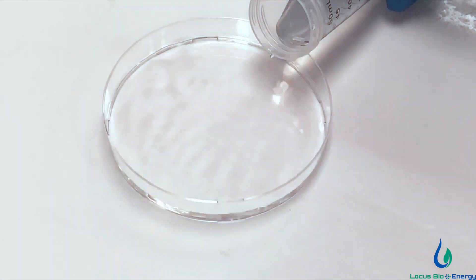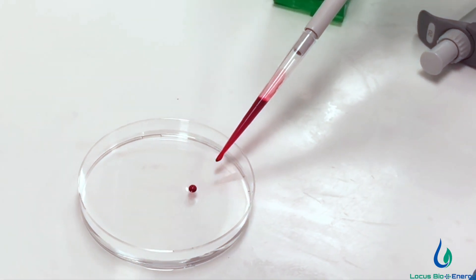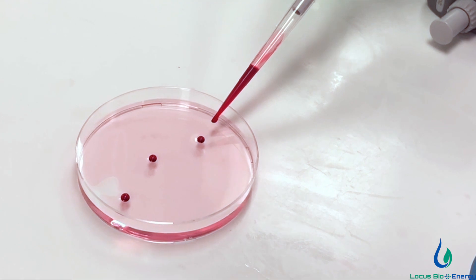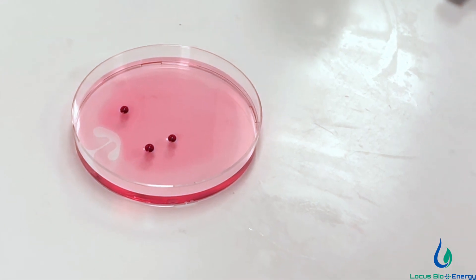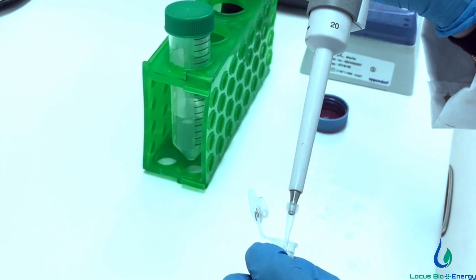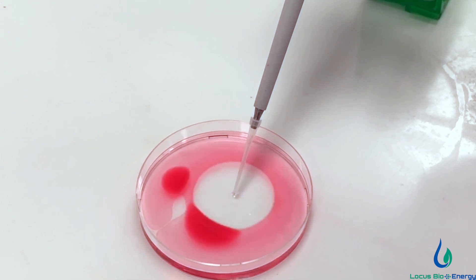We add water to the petri dish, followed by a few drops of the colored oil. The oil forms a thin layer over the water. And finally, we dip the needle of the syringe in the biosurfactant, not drawing anything, but just dip it.